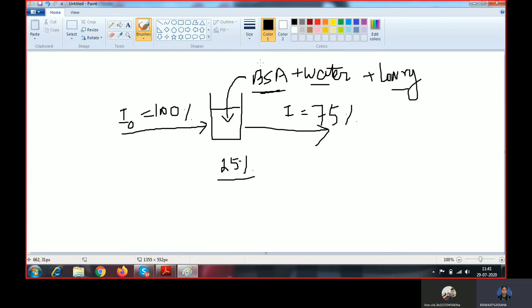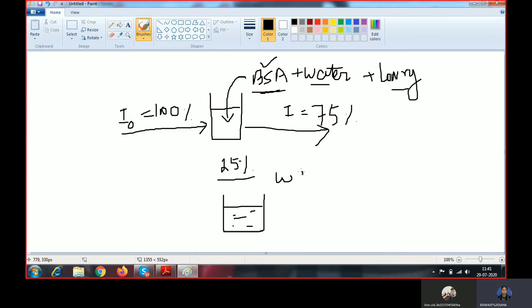You need to measure what is the actual absorption made by the bovine serum albumin. In order to do that, you have to take a blank solution. What is a blank? Blank means it contains all the things except the protein. That means it is made up of water as the solvent, and you are adding Lowry reagent into the sample as well, but no protein is present. This is what is known as the blank solution.